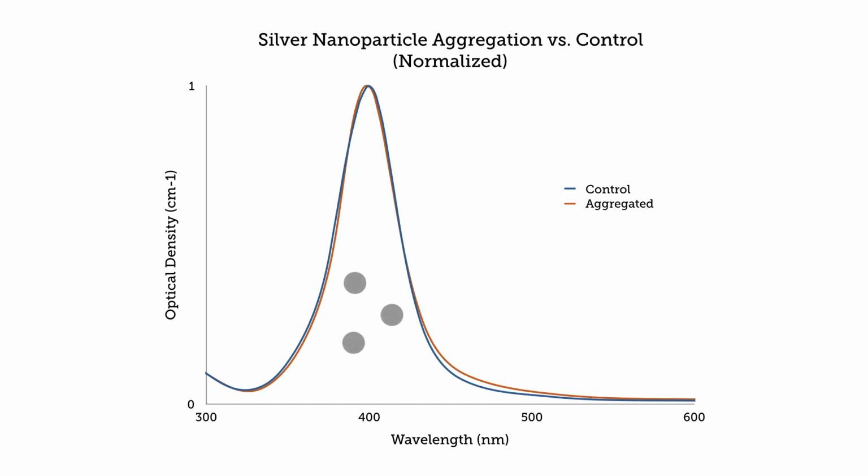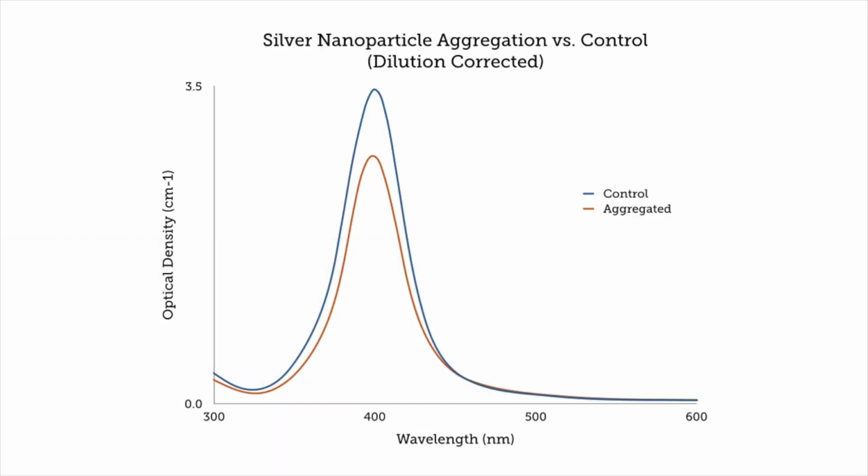So as these larger aggregates form, there will also be an increase in absorbance in that range. This in turn typically results in a decrease in absorbance at the peak because some of the nanoparticles that once absorbed at the peak wavelength are now in the form of aggregates. The absorbance at the peak drops and absorbance increases in the wavelength regions that the aggregates absorb.